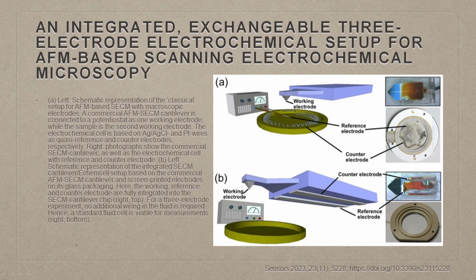The reference electrode is almost like a universal reference, like the hydrogen electrode, which gives you a reference value for everything. This is just like pH. Based on this, something will be acidic, something will be basic.